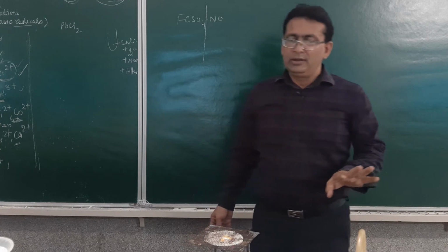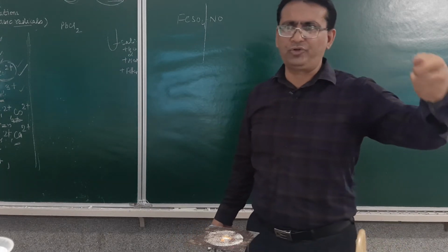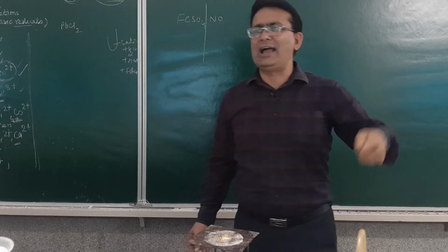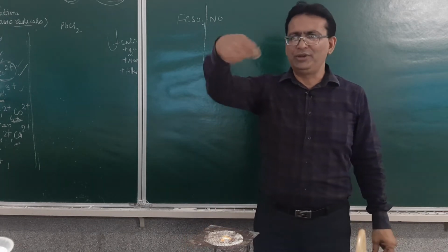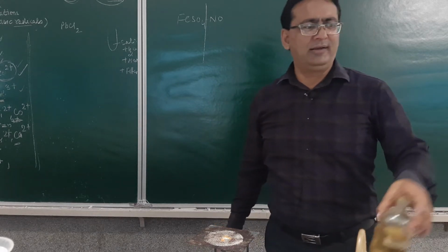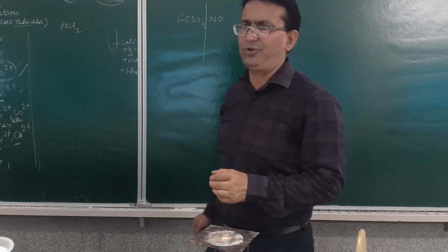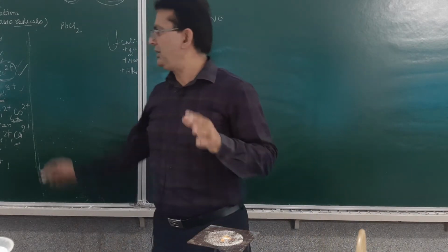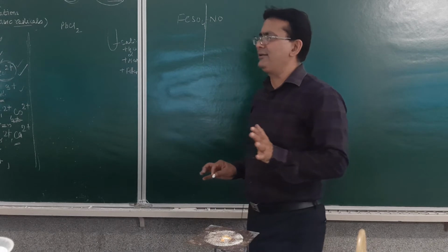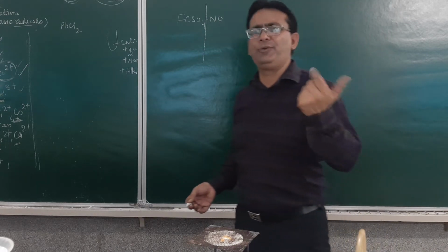And that is why I am saying that your hand must be stable. Do not shake. The students are generally in the habit: nothing is happening, so they start shaking the test tube. Fine? So that will in fact finish your work for the identification of a nitrate ion. Similarly, there are 12 radicals in the syllabus, 12 acidic radicals, anions, which you have to identify. You will be getting one definitely from there.